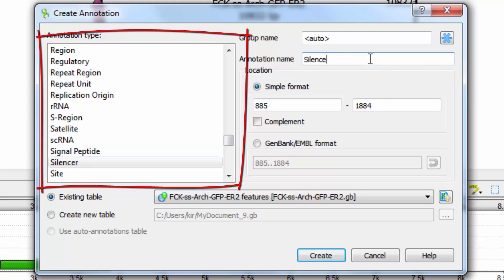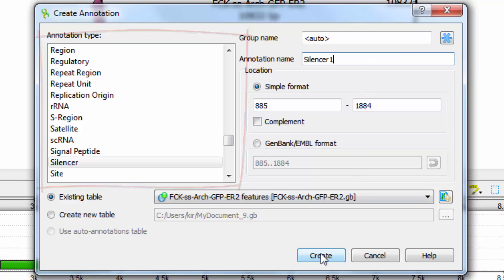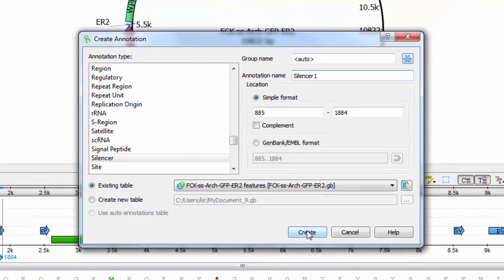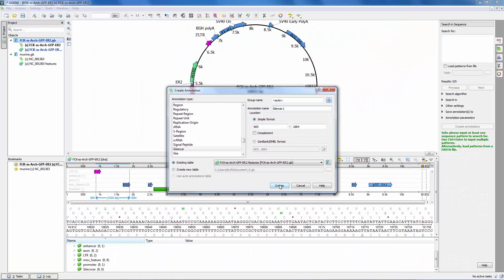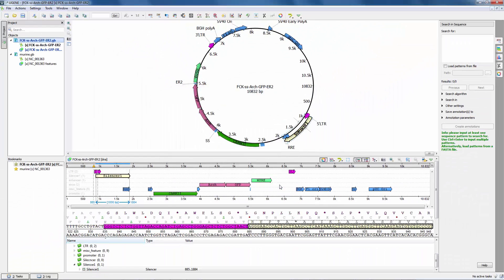The Create Annotation dialog in Eugene has changed. Particularly, now it has a separate field with a list of feature types. The list of types is extended if the opened file is in the Vector NTI format.